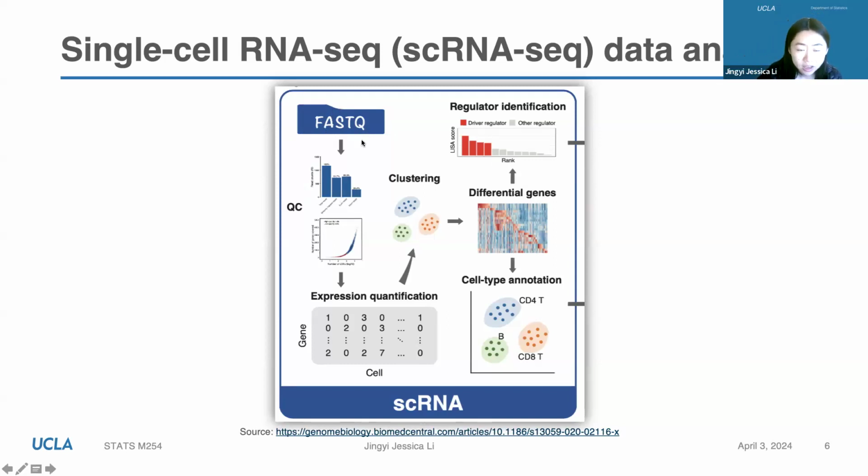So basically, the quality control step is here, the QC is for the read quality control. Maybe you will not keep everything in the FASTQ file, but now these things are typically done in the read processing software from the sequencing company. So you will convert the FASTQ file by mapping the reads to your reference genome.